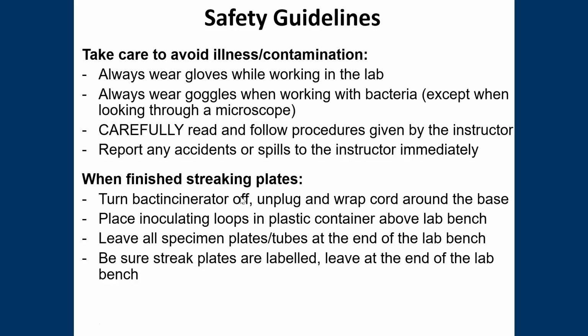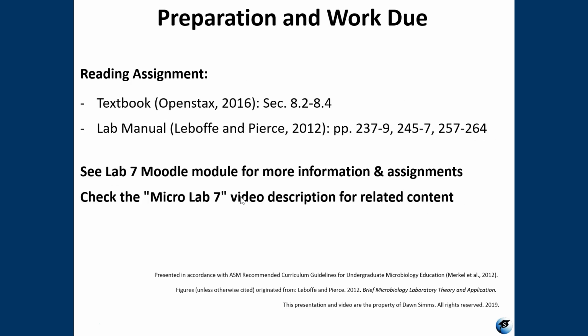You do want to make sure, as usual, to go through your safety guidelines. We're running a lot of different tests this week, for Lab 7 and Lab 8, so be very mindful of your aseptic technique. Be careful with your bacticinerators and hot plates. We're actually only running 3 tests in Lab 7, and 2 of them you're going to get your results right away, and they're just yes or no, your catalase and oxidase tests. And then it's time to come back and look at the carbohydrate fermentation test, where you're going to be looking for acid production and or gas production. So it's pretty straightforward.